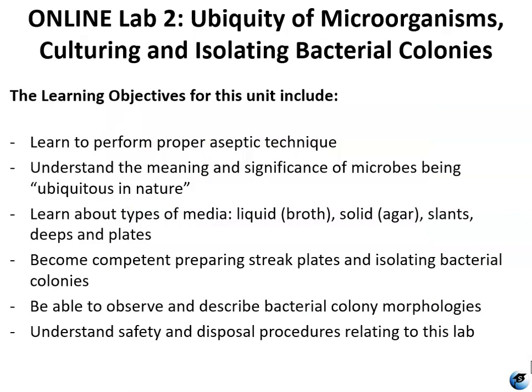The learning objectives for this unit include learning to perform proper aseptic technique, understanding the meaning and significance of microbes being ubiquitous in nature, learning about different physical types of media like liquid broths, solid agars, slants, deeps, and plates, becoming competent preparing streak plates and isolating bacterial colonies, being able to observe and describe microbial colony morphologies, and as always, understanding safety and disposal procedures relating to this lab.